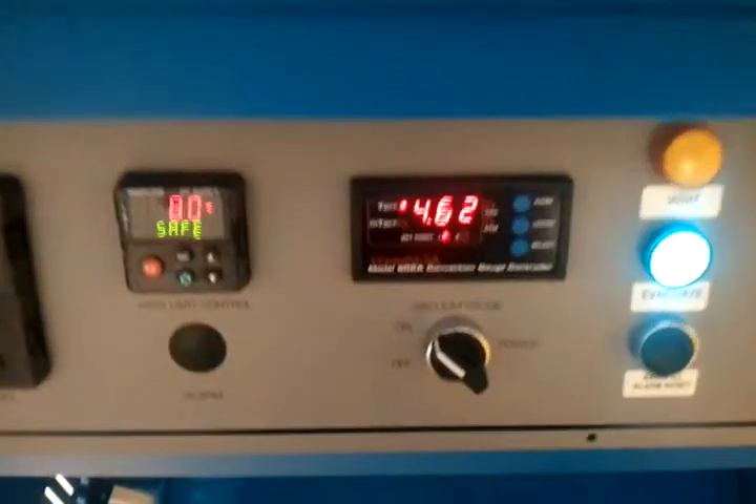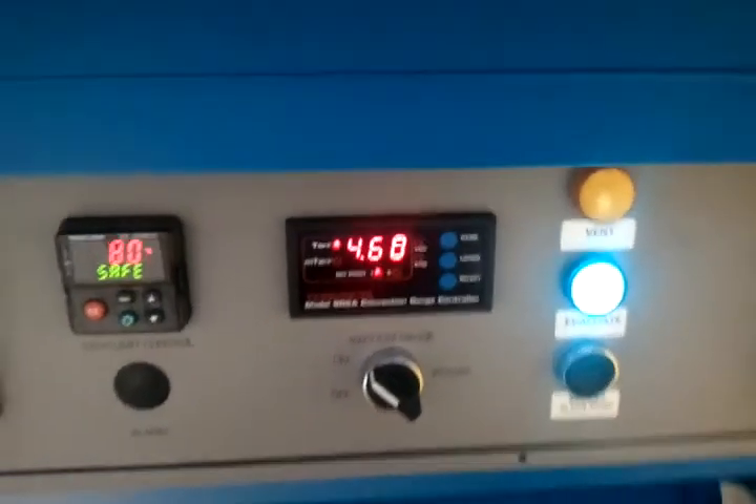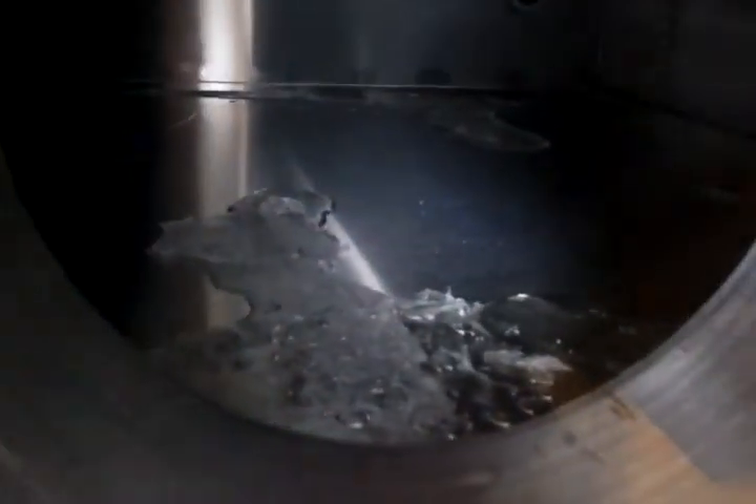We're down a little under 5 torr. So there we go — we made ice cubes in a vacuum oven.